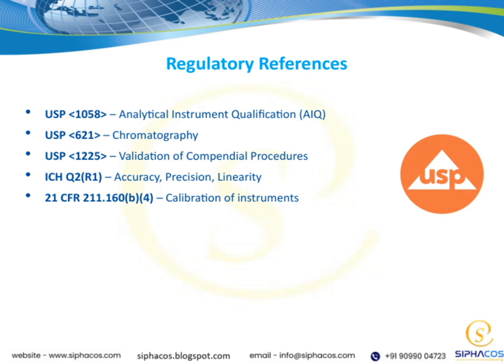Finally, 21 CFR 211.160(b)(4) addresses the calibration of instruments, reminding us that proper calibration is essential for maintaining data integrity and compliance. Altogether, these references form the backbone of our quality assurance framework, helping us ensure our processes are both effective and compliant with regulatory expectations.